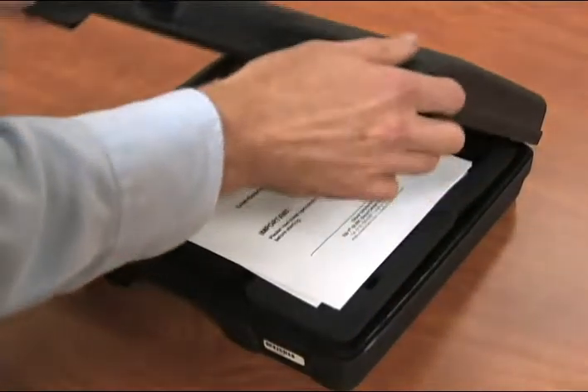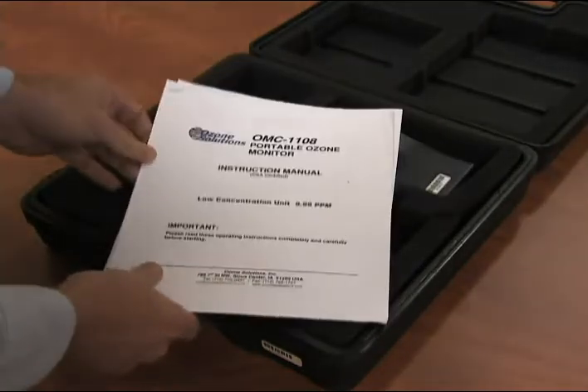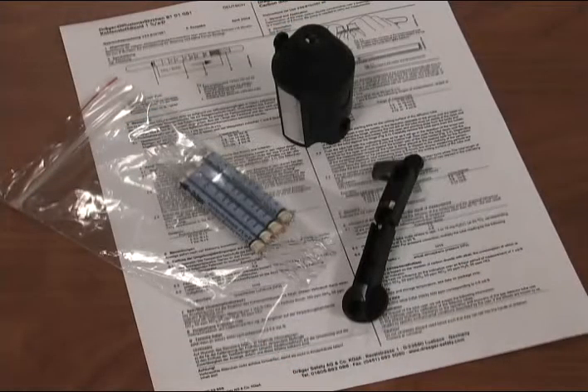You should receive the correct type and number of tubes along with a set of instructions on how to use them. You should also receive the appropriate number of tube holders. In addition to explaining how to use the tubes, the instructions will also tell you about potential interferences and how to dispose of the used tubes.